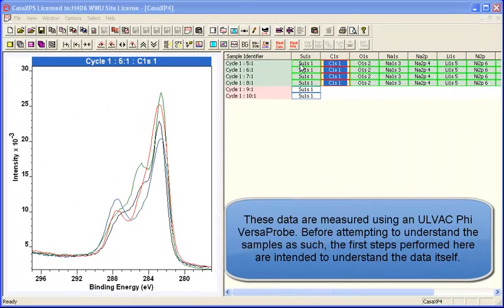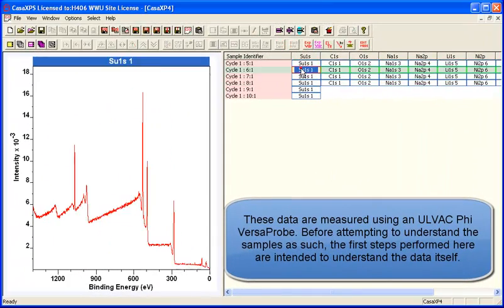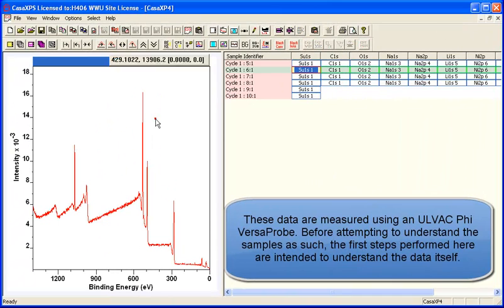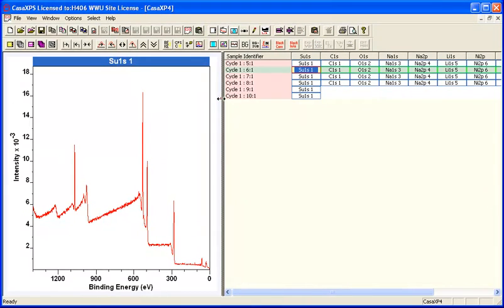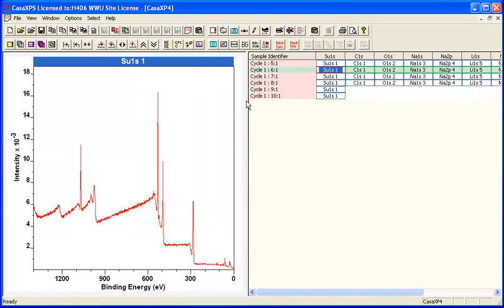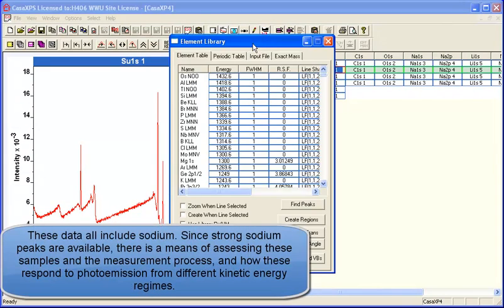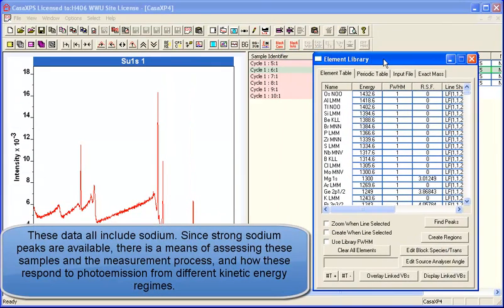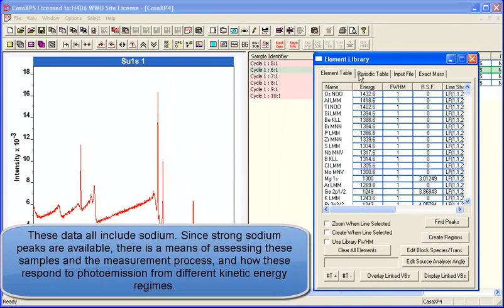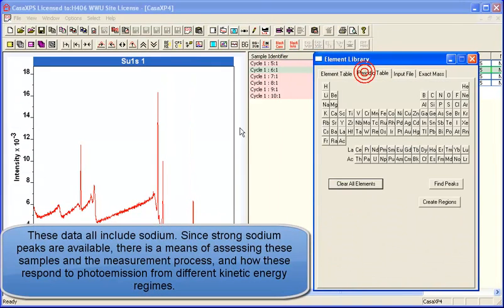When presented with some data, the first thing you might want to do is check that the data makes sense. One of the ways you can do this is by using the element library.